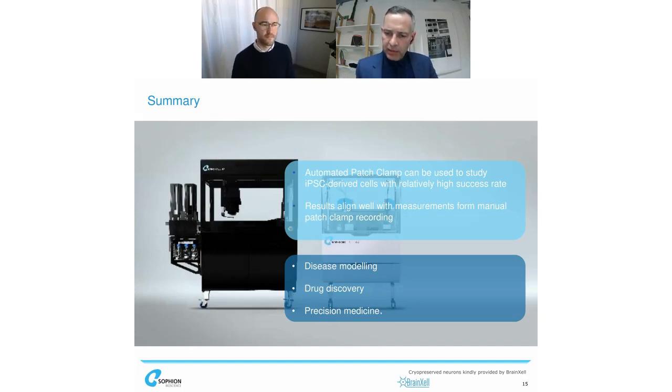Okay. And Kalai was asking a two-part question. Does the capacitance of the cells increase when cultured for more days, corresponding to the decrease in the success rate? And does culturing for more days favor the maturation of these cells? So the capacitance was stable. That's why we didn't show the densities here, especially when doing the comparison in the disease models. And then for maturation, absolutely. What we found is that keeping them longer in culture certainly benefits the maturation of the cells, since we are also using that proprietary process that BrainXell had provided us, which further matured the cells even when we had them in culture in our incubator.